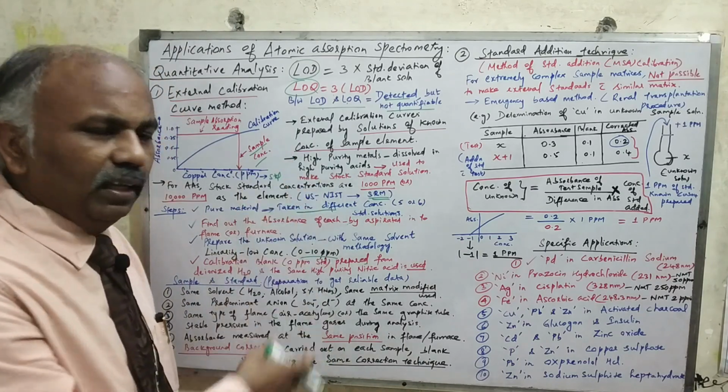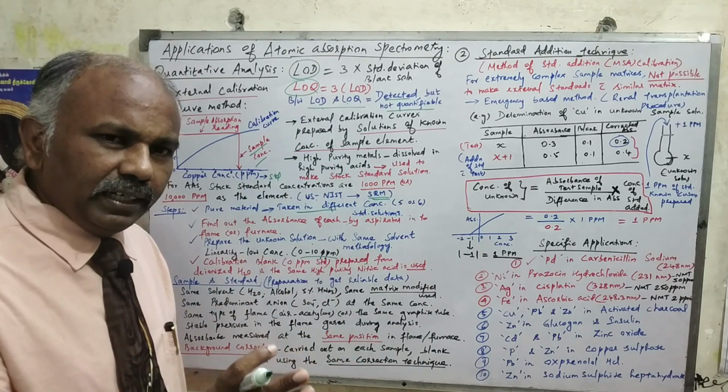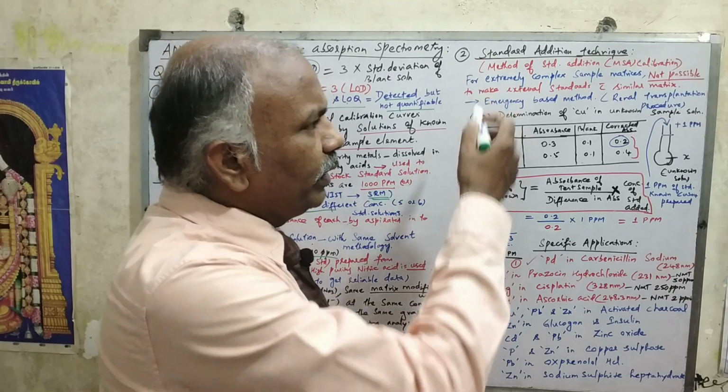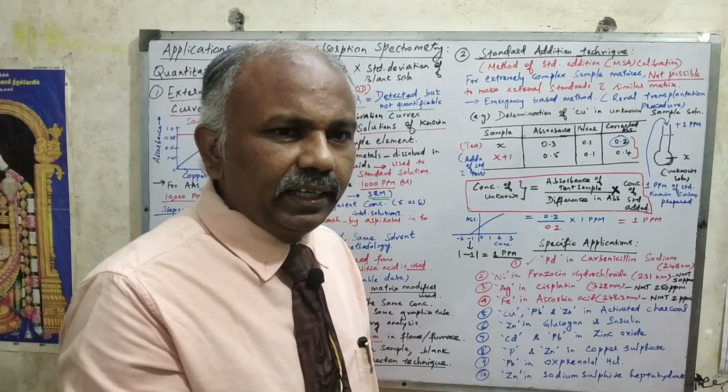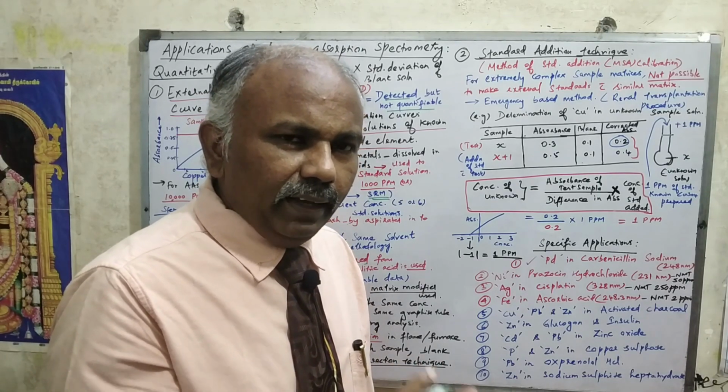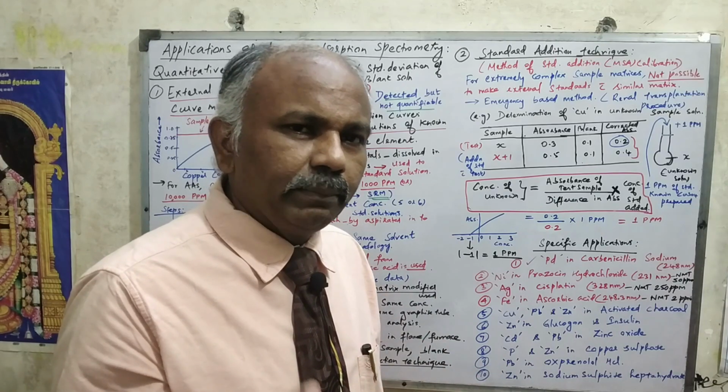Then only you will get the accuracy here, right? So obviously it is a time taking process. The second important method we are going to discuss is the standard addition technique, which we also call the MSA calibration technique. What is MSA? Method of Standard Addition Calibration.